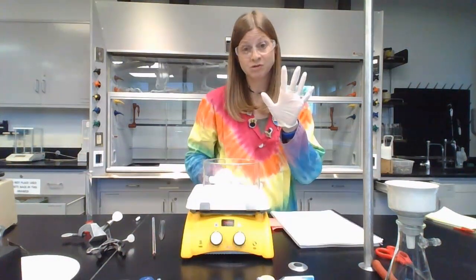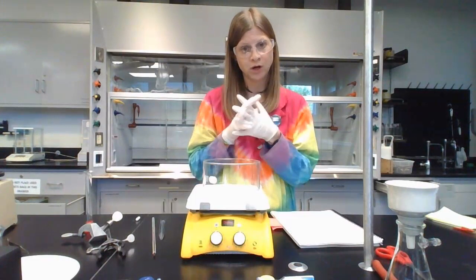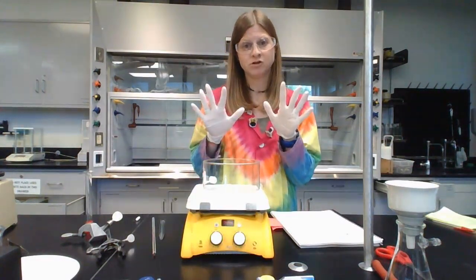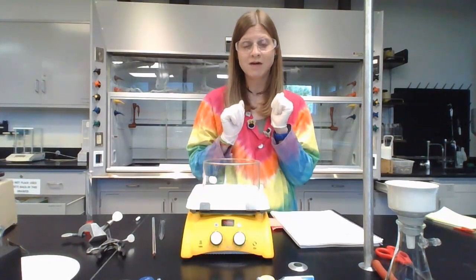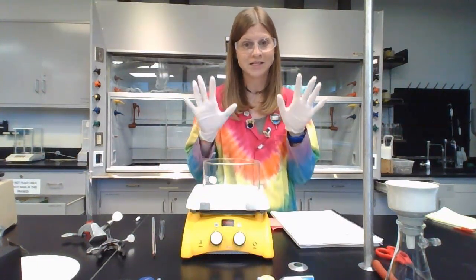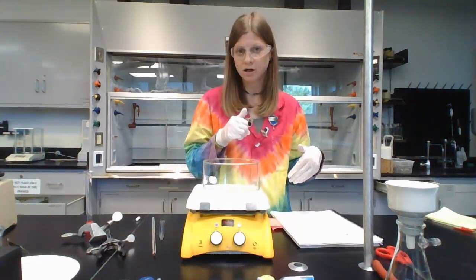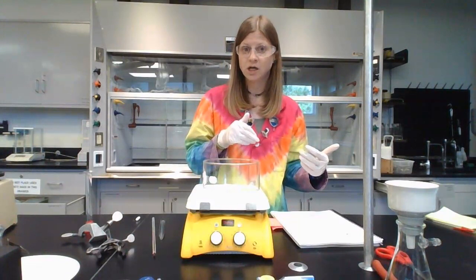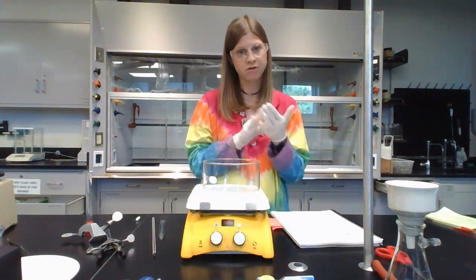And I forgot, we have to wear latex gloves for this lab. Latex gloves protect us best against organic chemicals. So if you have a latex allergy, you're going to put on 2 pair of nitrile gloves, then a pair of latex gloves. If you do not have a latex allergy, just put on 1 pair of latex gloves. You will be asked to change your gloves periodically throughout the procedure. If you have a latex allergy and you have on 3 pairs of gloves, you're only changing the outside pair. The other 2 should be fine.